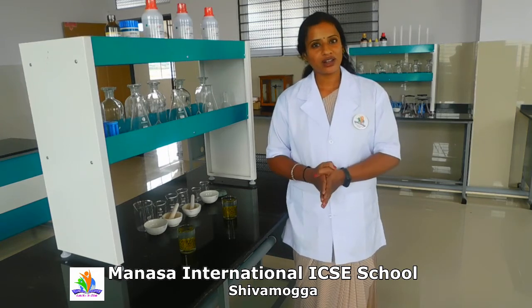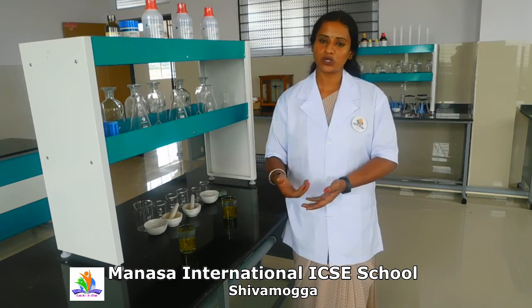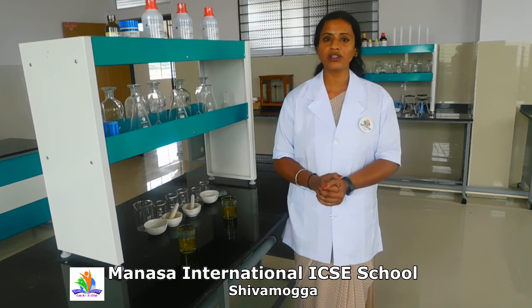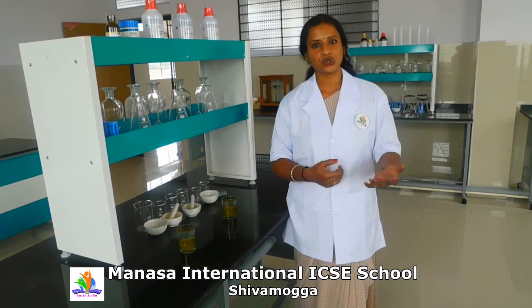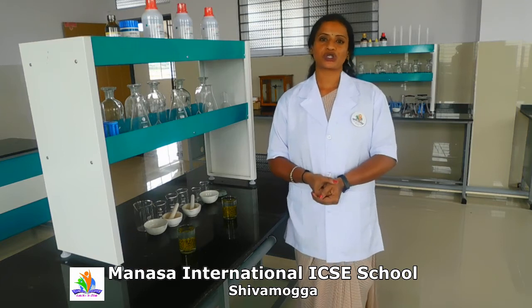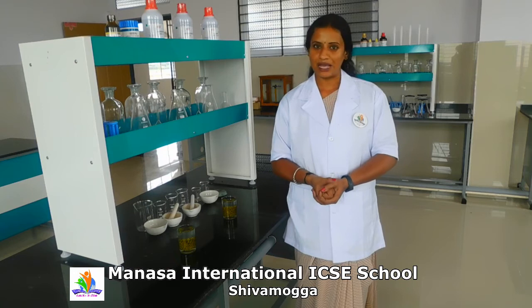We should be very alert when we enter the chemical laboratory. It's not like you are entering an amusement park or any other place where you can be very careless. This is a place where you should be very careful because you are handling chemicals. Some are acids, bases, some solutions, some indicators, reagents, etc. So dear students, the first precaution is wearing this apron before entering any laboratory.